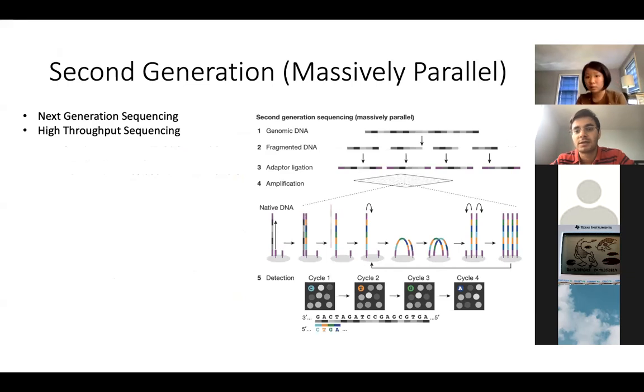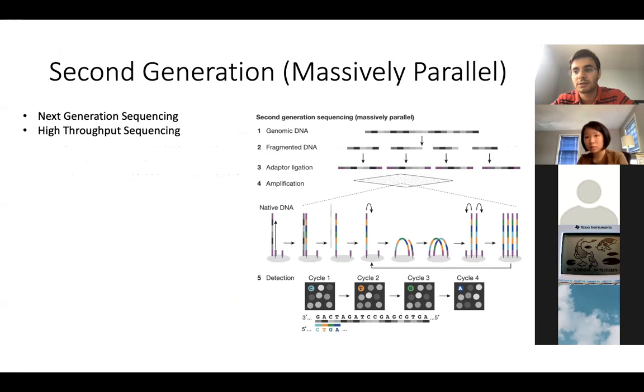Well, nowadays, what I call shotgun sequencing is next generation sequencing, and I'm not entirely sure how shotgun sequencing was done prior to Illumina, because my understanding of shotgun sequencing is what they call small read sequencing.